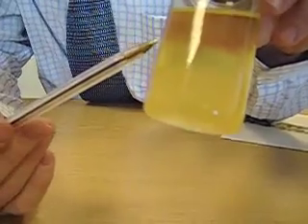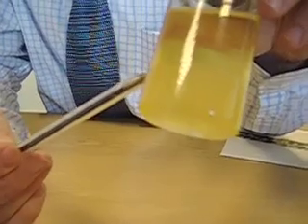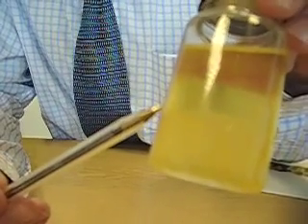This should not be confused with winter waxing and crystallization. I've just taken the sample out of the fridge, and as you can see, there's white wispiness inside there, resembling a cotton wool appearance. That is not magnesium silicate — that is indeed winter waxation.